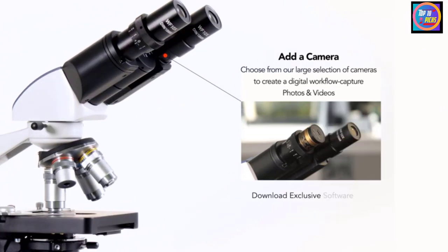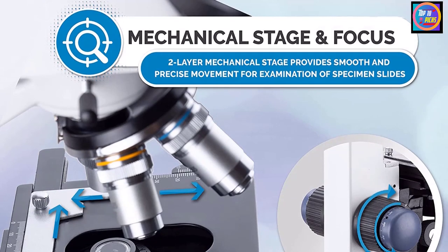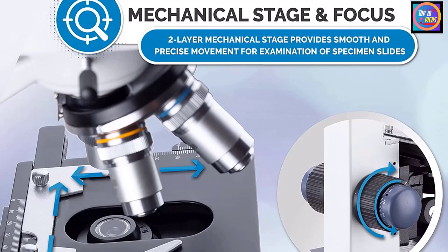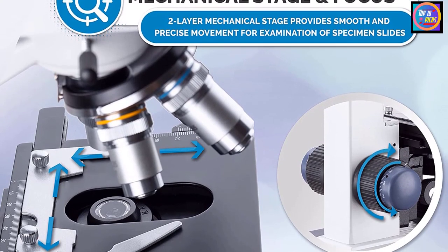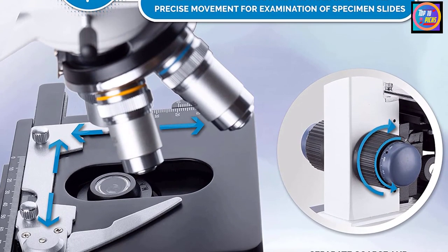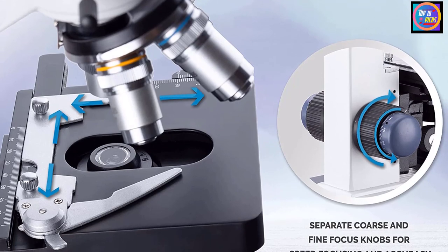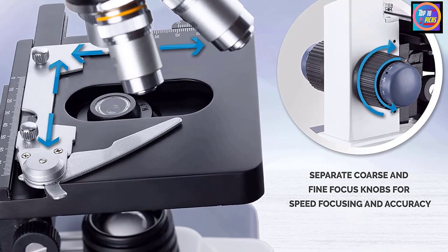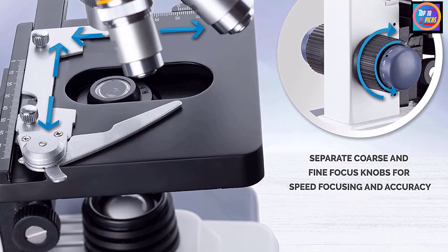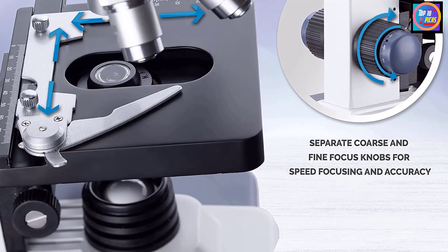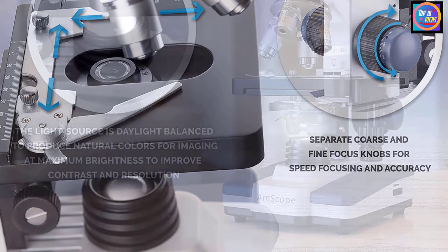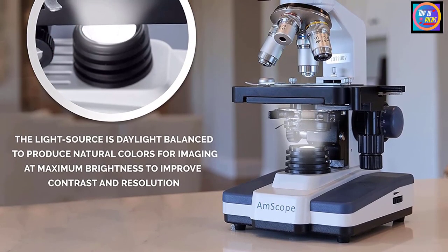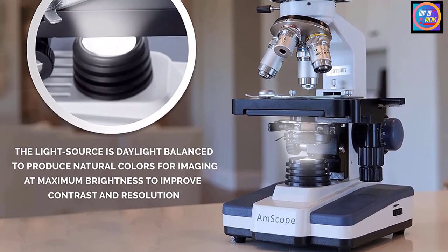Let's not forget about the 1.3 MP digital camera included with this microscope. You can connect this camera to almost any computer and capture images or even stream live videos, making it a perfect purchase for professionals such as lecturers using it in a classroom setting. There's also the Radical 2500x High Power LED Cordless Microscope that comes with 3 rechargeable AA batteries. This glass optical system has a movable Abbe condenser with an iris diaphragm and 3D mechanical stage, and 25 biological prepared slides are included.